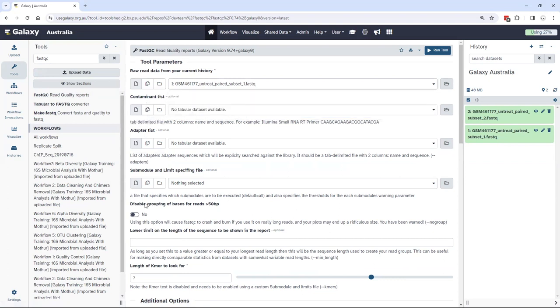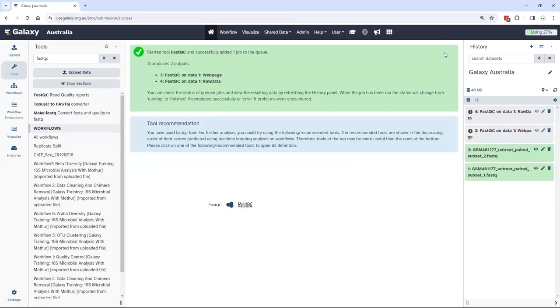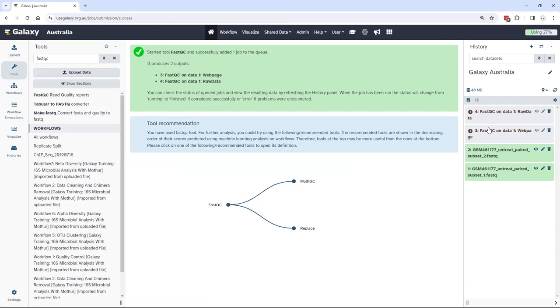FastQC, like many tools on Galaxy, has a number of other configurable options, all of which I'm going to leave as default at the moment. When I click Run Tool, that tool is immediately queued up on the Galaxy system. The tool and the data set size dictates the amount of resources it gets and the destination it goes to.